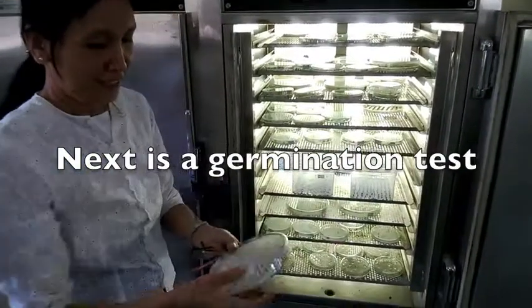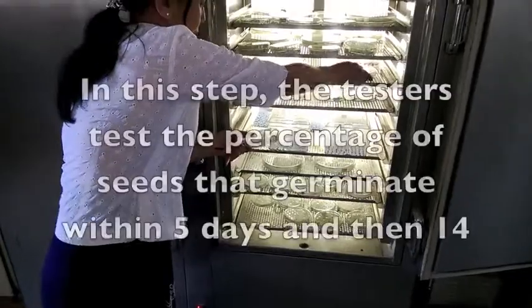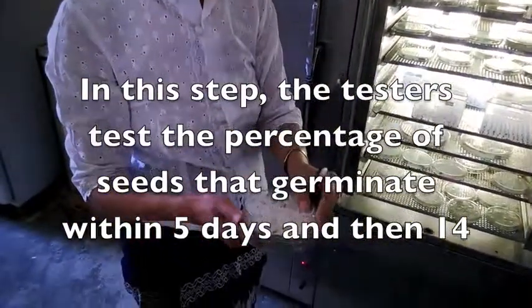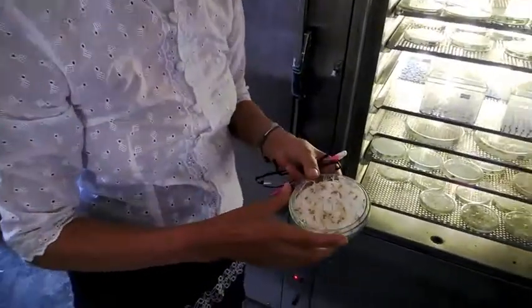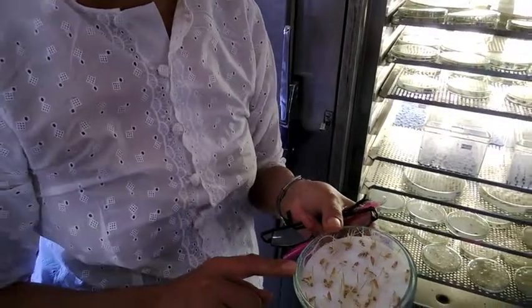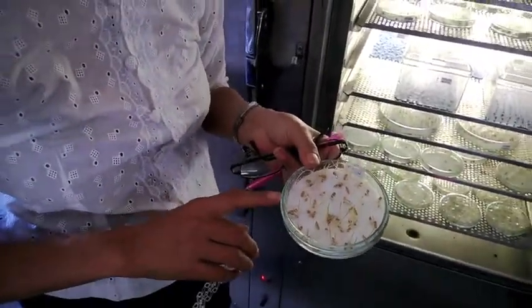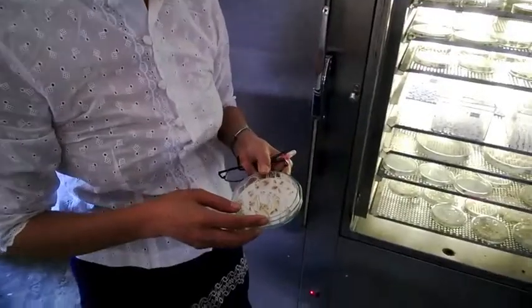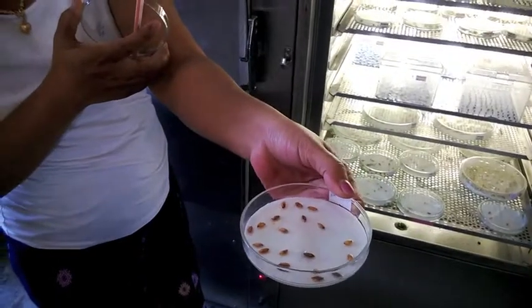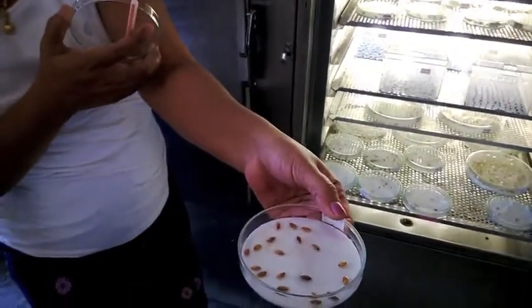Here there is a germination test. We take from the pure seed and put it in a little container, then add some humidity. After five days — this is now after five days. This one is eight days but there is no germination yet; they have to wait. This one is six days already.